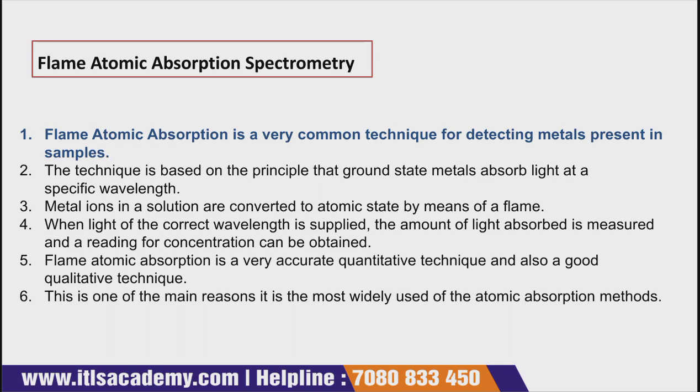The simple definition is this: it is a very common technique whenever you want to detect a metal that is present in a sample. Especially when I'm talking about metals, and you want to detect them in the sample, the technique most commonly used is flame atomic absorption spectrometry.